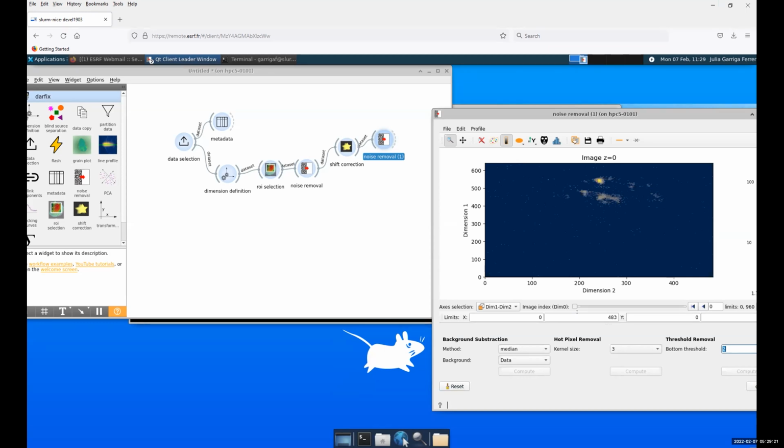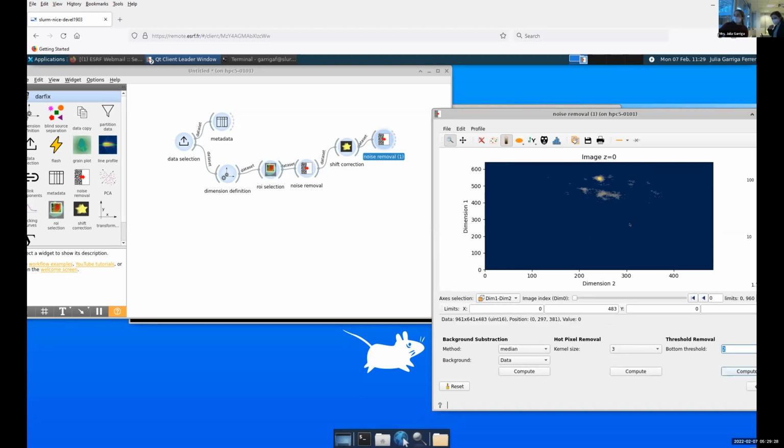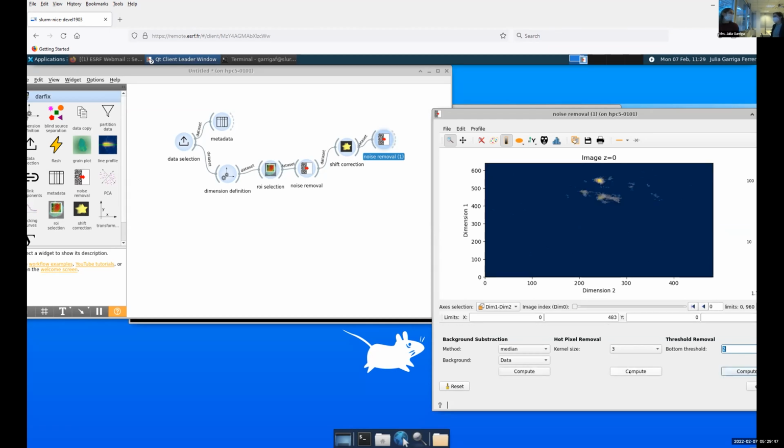So noise. You can see now hot pixels, how much. There's still some, but this doesn't bother us so much. If there are still some, we can just compute them again. The more information you have on the different orientations, which is how it was assigned in the mosaicity map, the harder it is for the blind source separation operation to compute everything.